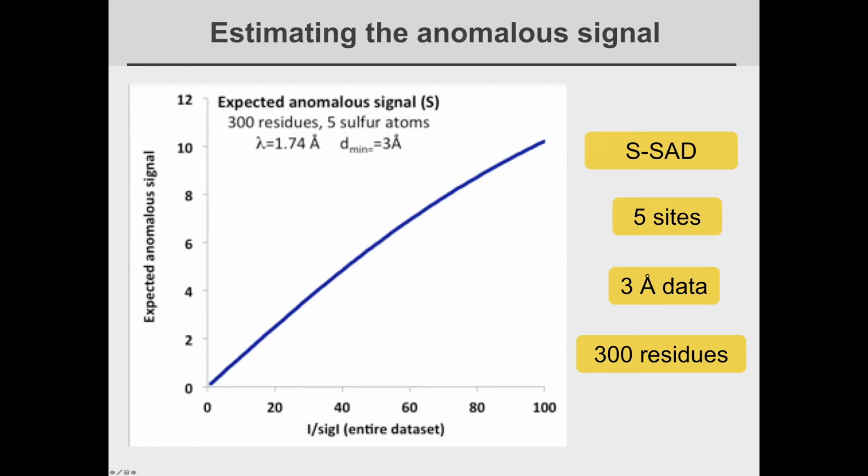Great. And then one other question is, if we have a large number of sulfurs, i.e. disulfide bonds, in this case 56 sulfurs in 800 residues, according to the formula we'd actually prefer to have fewer sites. Is that correct? Well, if you have 50 sites in 800 residues, that's just what you have, right?